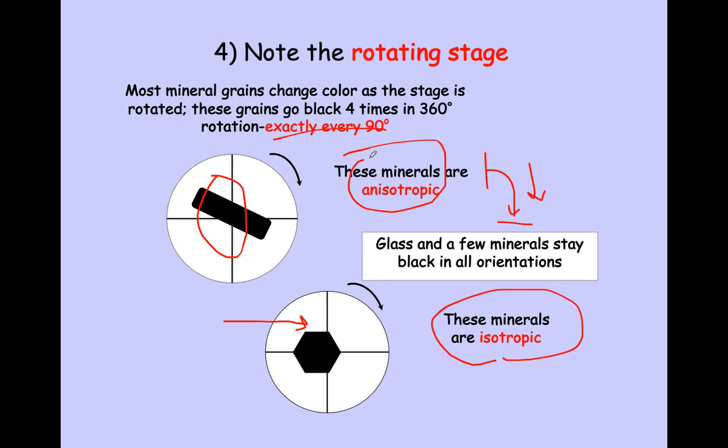These are the main categories of minerals that we can find after inserting the second polarizer, right? Some minerals can reorient the light and the other ones cannot. Those which can reorient the light, we call anisotropic minerals, and those which cannot reorient the light, we call isotropic minerals. So the first two main categories of minerals are these. Actually, this is an optical category, not a physical category: isotropic minerals and anisotropic minerals. This is another very important feature.